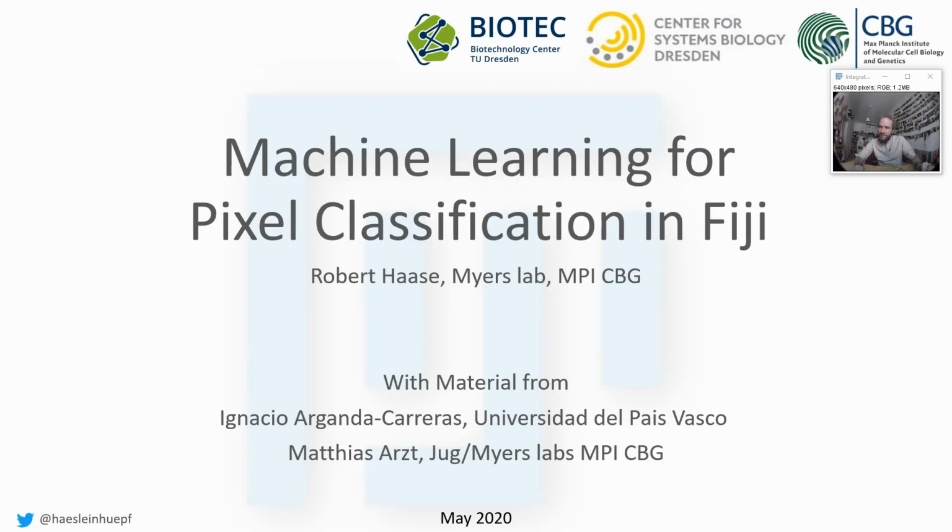Okay, that's it so far. In the next part, I will show you how to do pixel classification in Fiji.